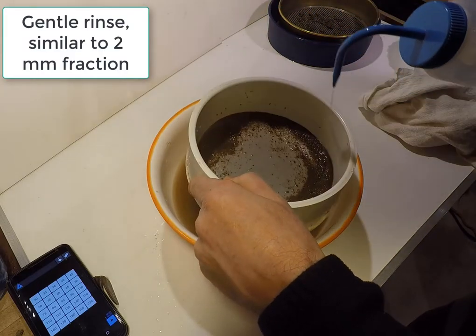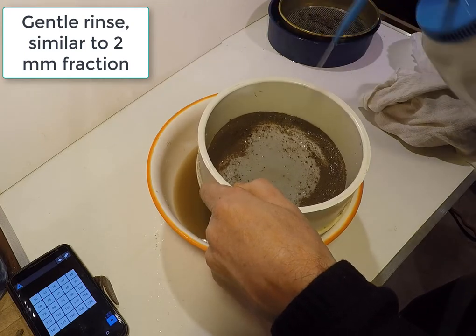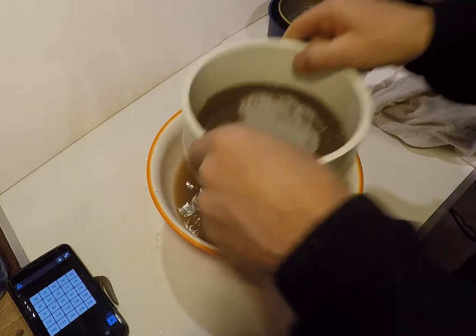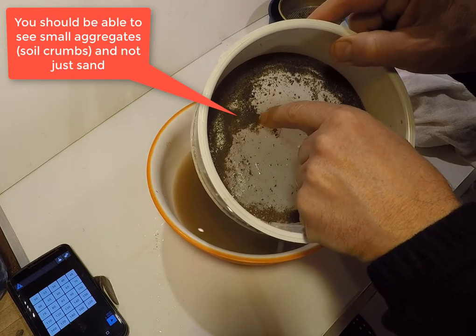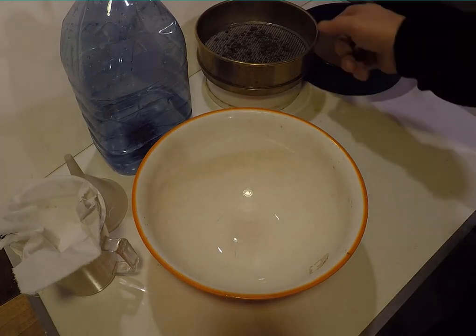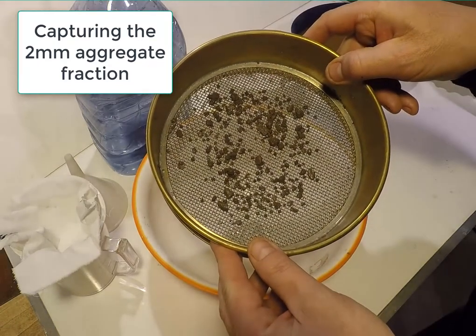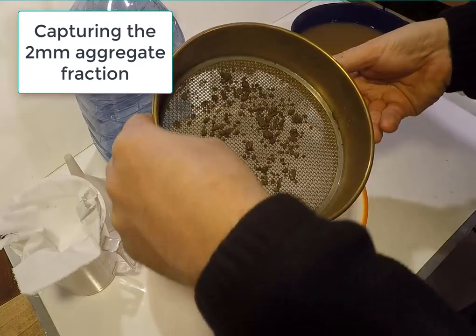This fraction is washed briefly in a similar way to the 2 mm fraction and then set aside to be captured later. Returning to the 2 mm size fraction, this is emptied into a large bowl and then transferred to a filter or cloth to remove the water so that it can be dried.